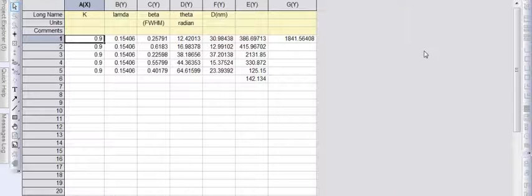Just simply use the calculator to calculate the values. First do the summation of the denominator values. It is coming out to be 3532.64015.